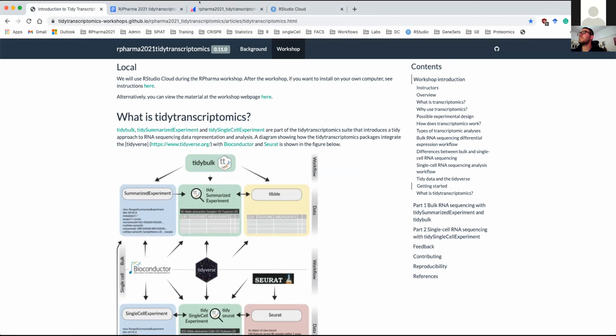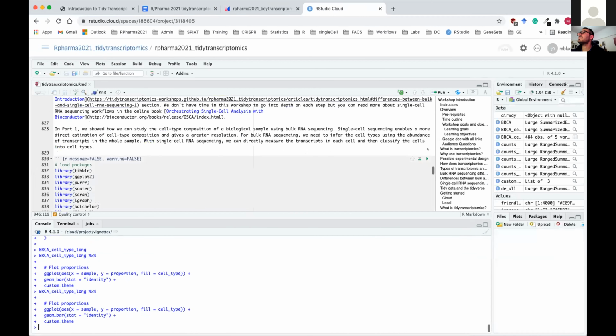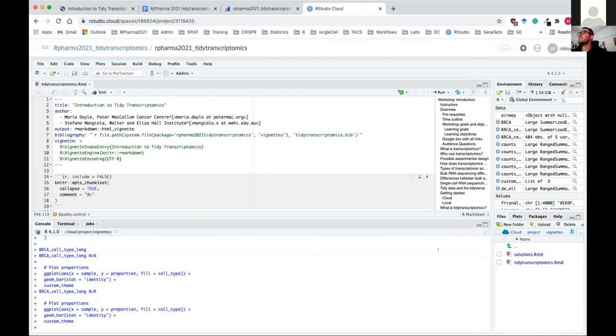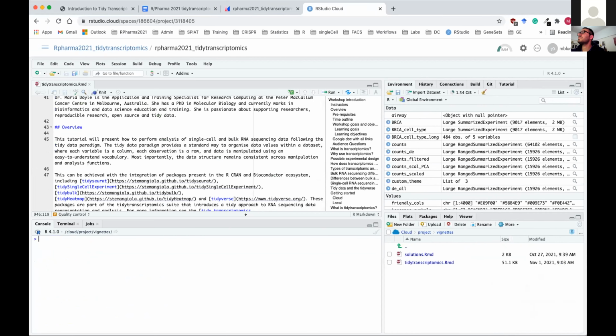Okay, great. Thanks, Bill. Okay, so let me see if I can start my copy. Okay, great. I'm going to just move up and clear off what was already done there. Okay, just get my windows organized.